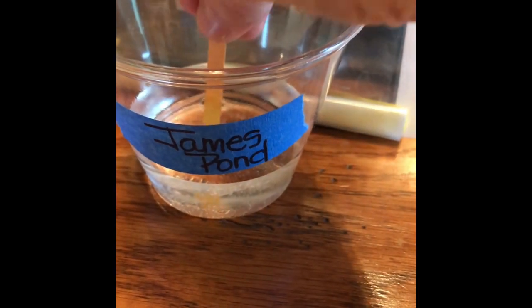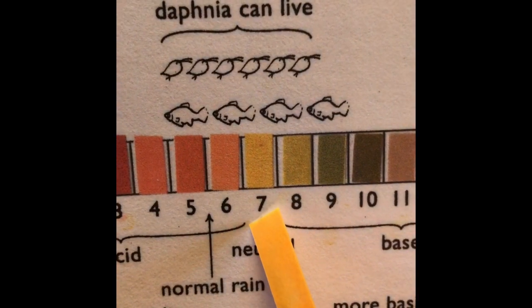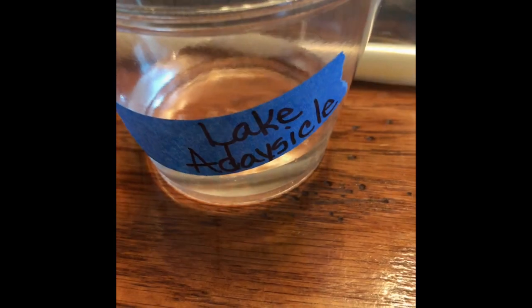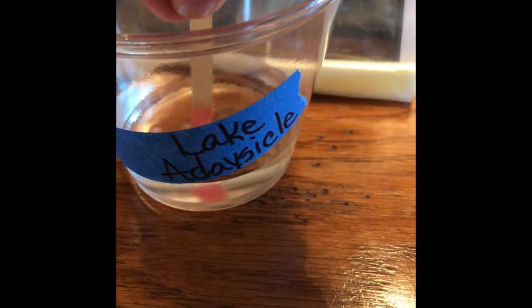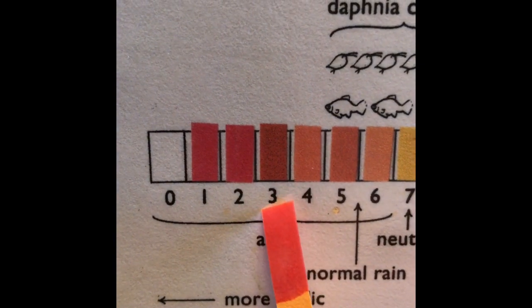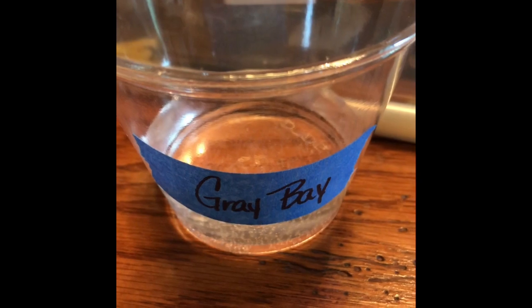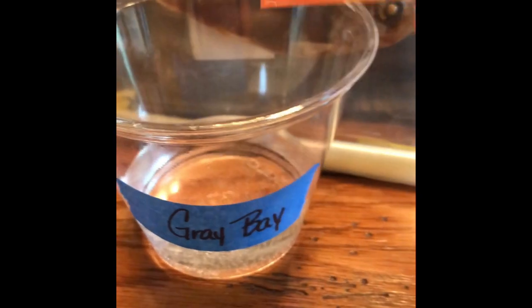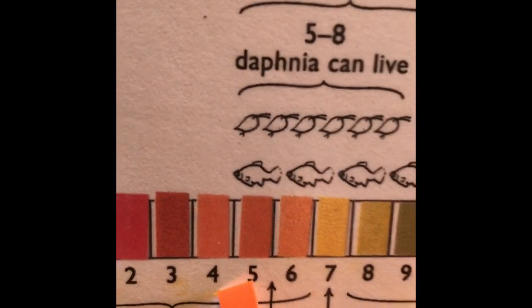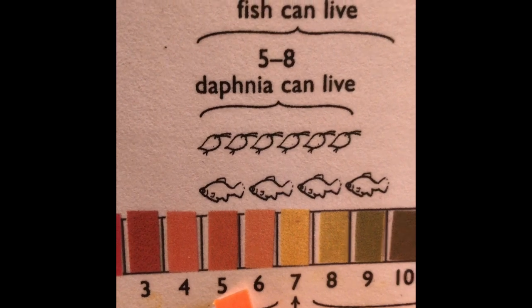James Pond, pH of 7. So James Pond, pH 7. Lake Adasical, pH 3. Lake Adasical, pH 3. Gray Bay, pH 5. Gray Bay, pH 5.